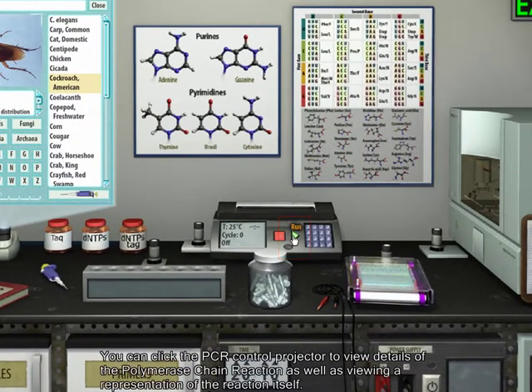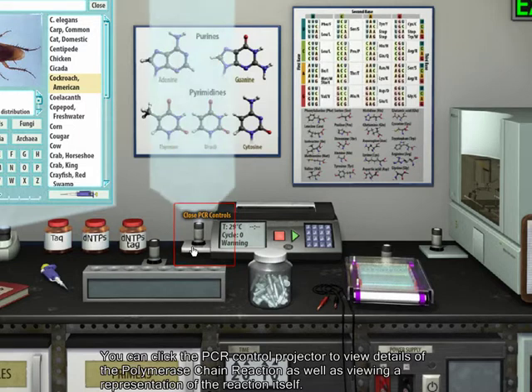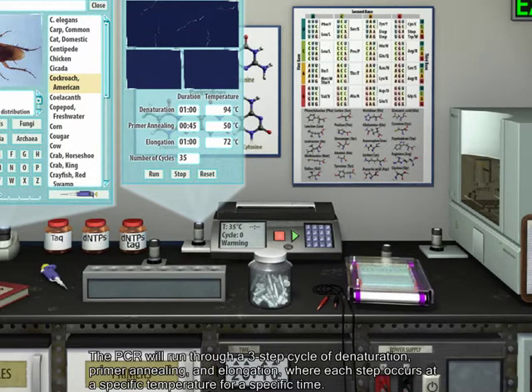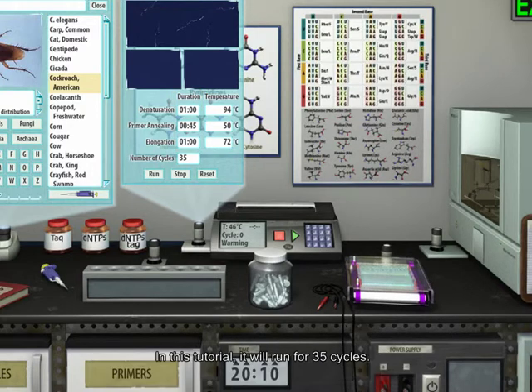You can click the PCR control projector to view details of the polymerase chain reaction as well as viewing a representation of the reaction itself. The PCR will run through a three-step cycle of denaturation, primer annealing, and elongation, where each step occurs at a specific temperature for a specific time. In this tutorial, it will run for 35 cycles.